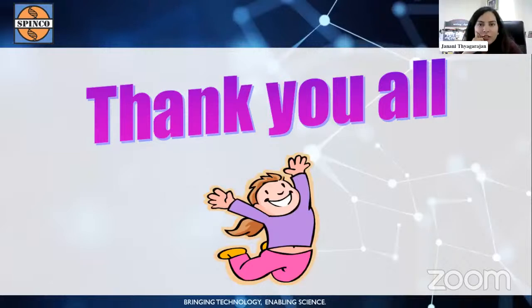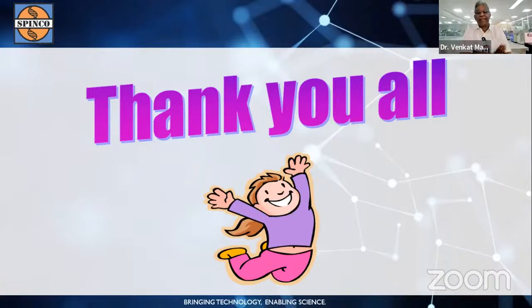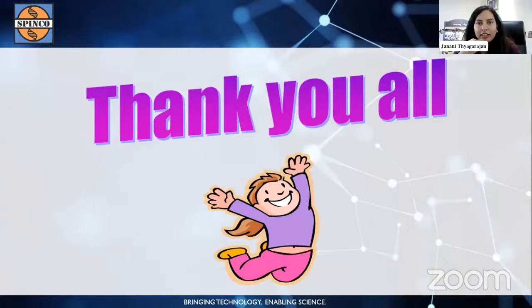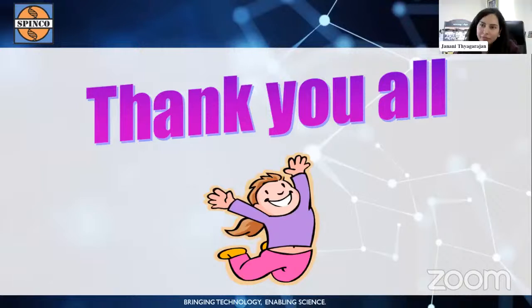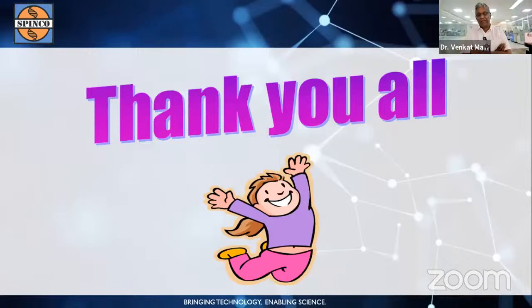So the poll results are out for the third one. That's correct. The people have gotten it right with the high resolution and large molecule analyzer, like if you want to analyze protein structures. And of course, 26% of the people have also gone for the laser instrument. Because it uses a laser, they thought it could be the answer. It is not wrong, but the most appropriate answer is the third one.